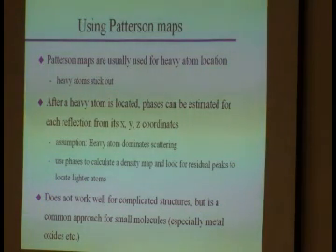Most of the time, you won't use your Patterson anymore at that point in time, okay? Because the difference is, now you can actually calculate some approximate phases, so you can calculate what is called a Fourier map, okay? You use those phases that you didn't have access to before, and you calculate your electron density maps. And then you work with those, because as I said, the assumption is your heavy atom dominates the scattering. The phases won't be absolutely right, but they'll be close enough to let you proceed. Okay?